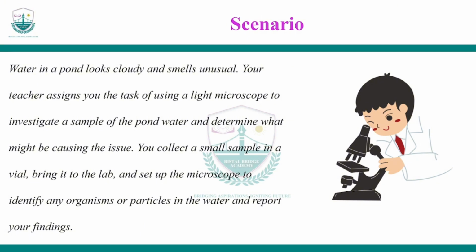You collect a small sample in a vial and bring it to the lab and set up the microscope to identify any microorganisms or particles in the water and report your findings.